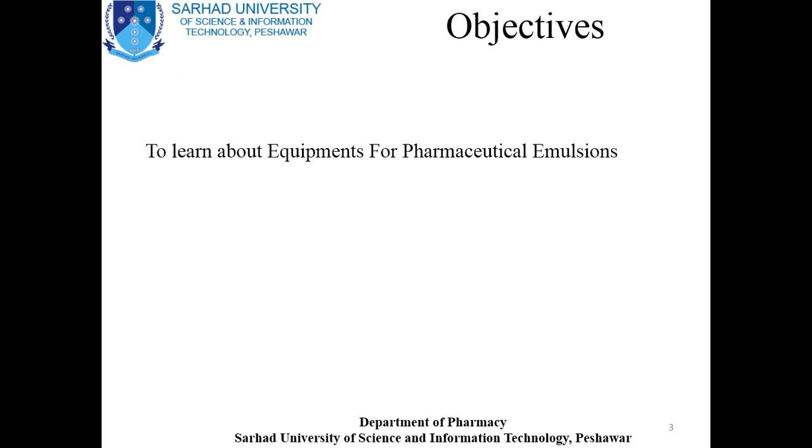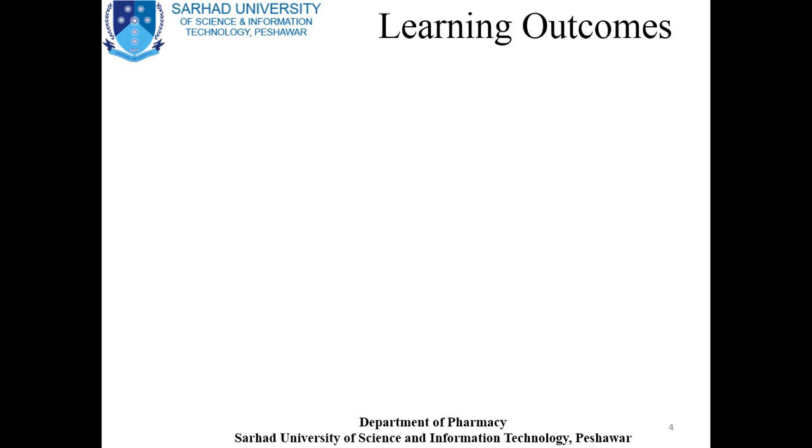The main objective of today's lecture is to learn about the equipment used for pharmaceutical emulsion.